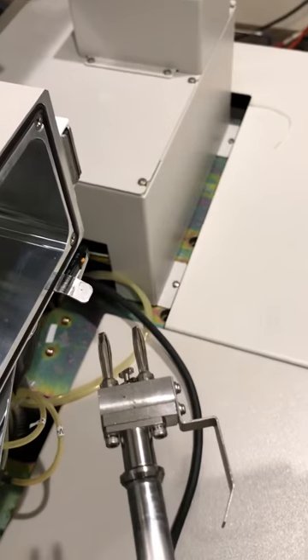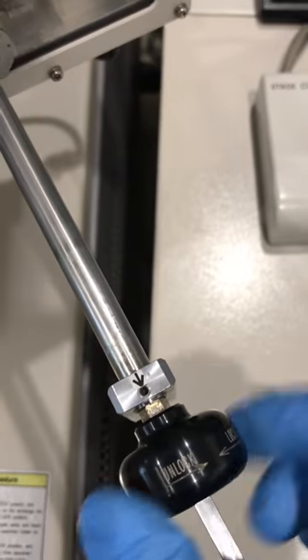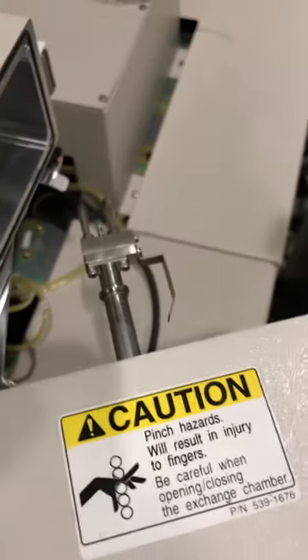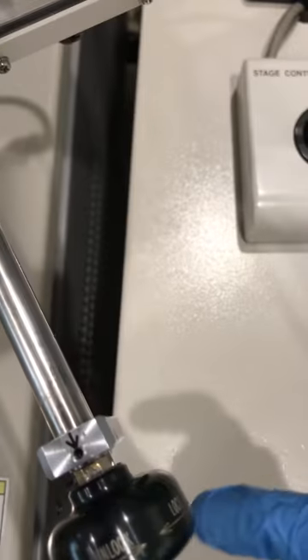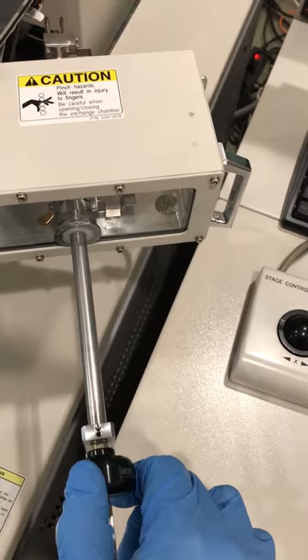You can see that the mechanism in the middle is turning as I turn the rod here. There are two to three positions: one is unlock and the other is lock. By putting this on the unlock position, I open the door.